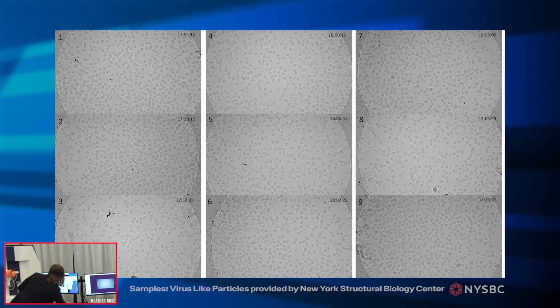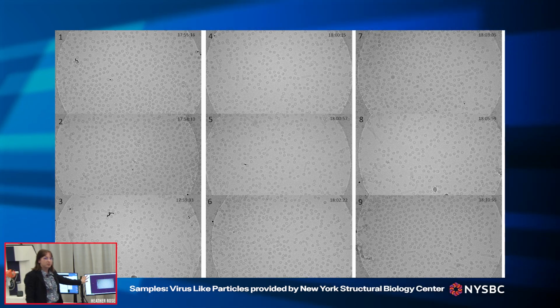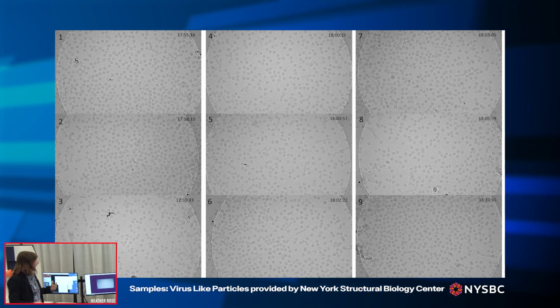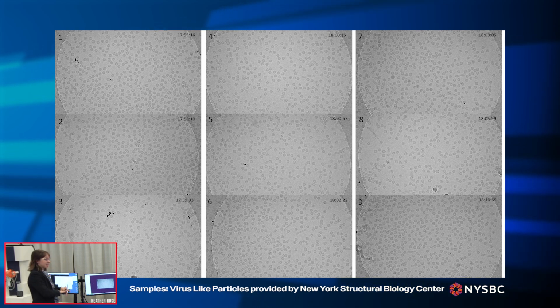So for example, we have a whole bunch of holes that I've imaged here of the virus-like particles. And I can then take these micrographs. I've maybe collected about 100 of these micrographs now. And then from there, I can import them into the software I was talking about earlier, CryoSPARC. CryoSPARC is free for academic use. And then I can have CryoSPARC pick out the particles that I want and then turn those into classifications to help me decide what the shape of my particle looks like.